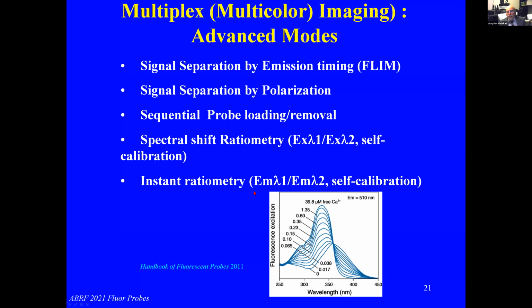And similar principle can be done as a ratio of emission wavelengths. Why is this self-calibration important? So if you recall, the final signal is product of different factors.